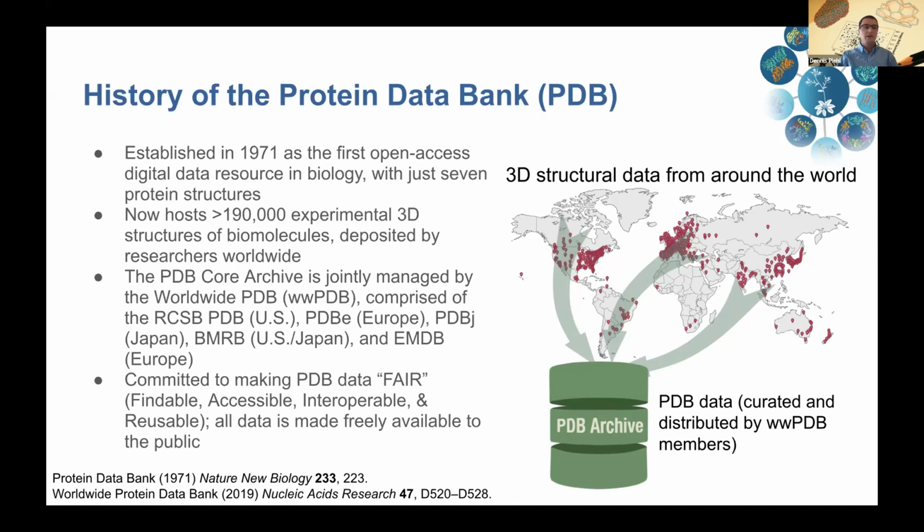These structures are determined experimentally by tens of thousands of researchers around the world using techniques such as X-ray crystallography, electron microscopy, nuclear magnetic resonance spectroscopy, and then they are submitted for deposition to the PDB archive, in which they undergo a thorough validation and biocuration process before they're officially integrated and released to the public.